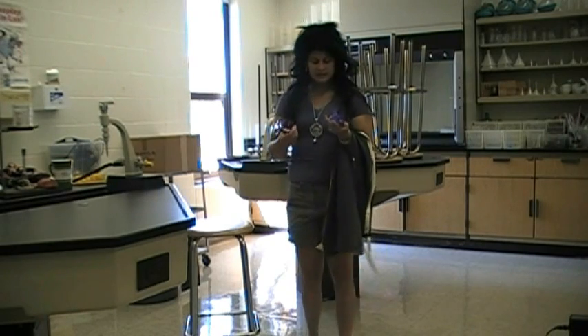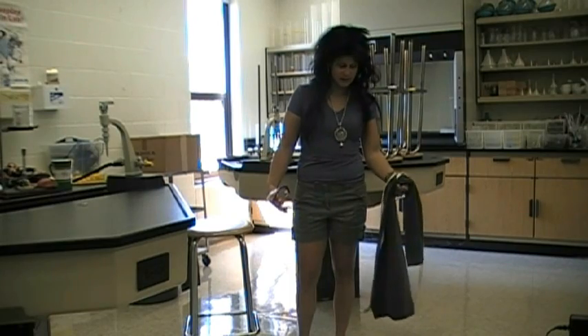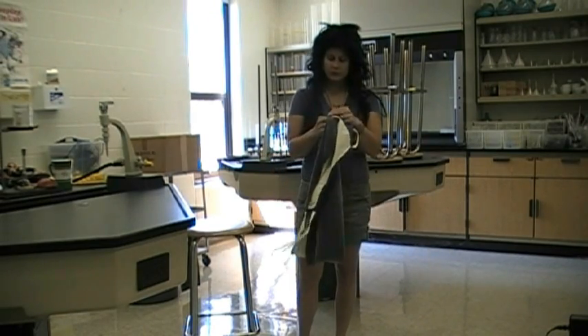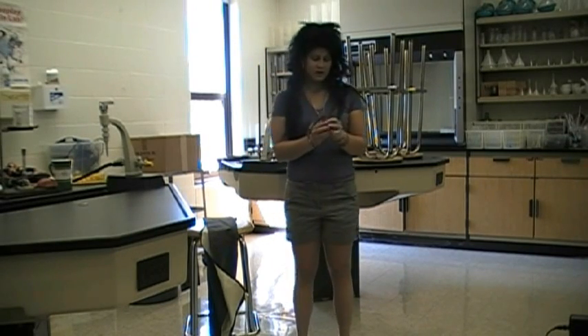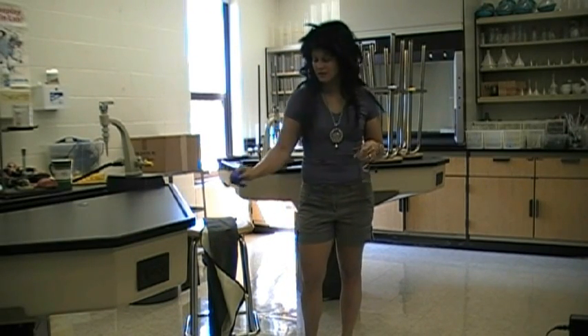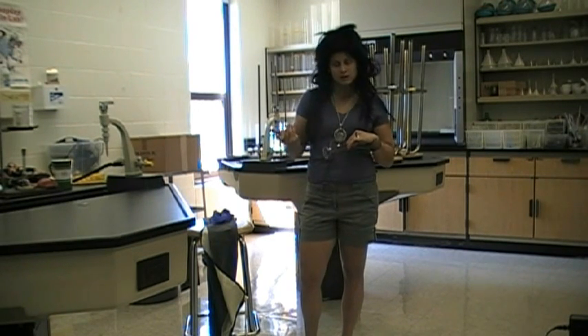Well, look at the stuff that they gave me. I put this outfit together with my shorts today, and I don't really think I want to wear a lab apron to cover it up. Gloves, they don't really go with my fingernails, so I don't really think they're necessary. Besides, I just don't like how they feel.